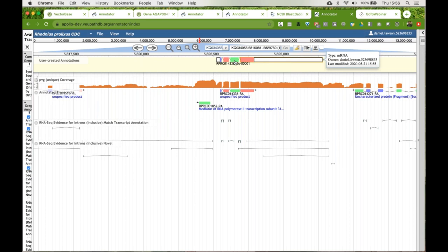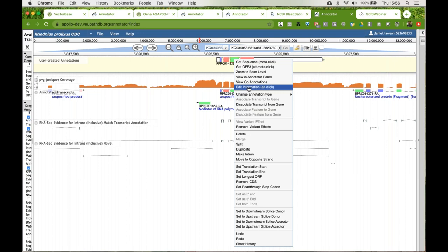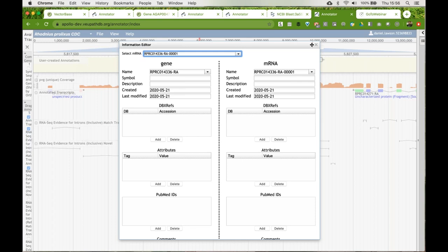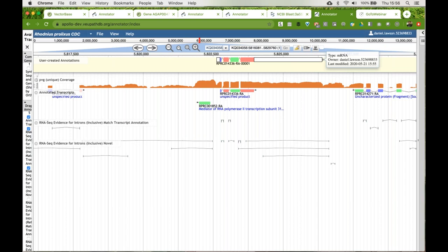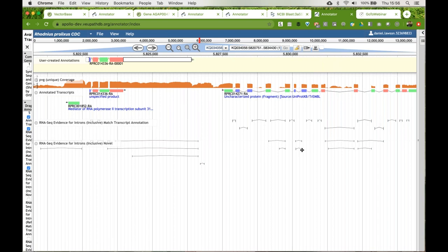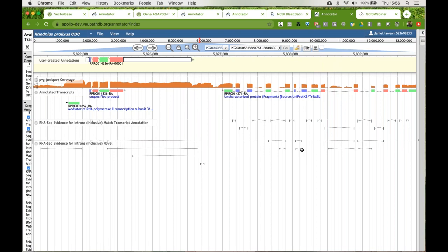This is a real change, so we would leave it here. We'd want to use the information editor to indicate that we've finished this prediction — we'll come back to how you can change statuses. There are other places here where there are prediction changes we could be looking at.